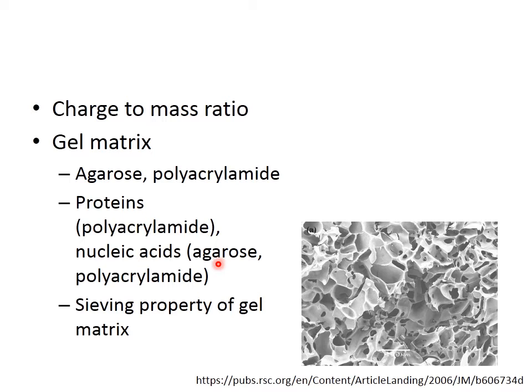However, small nucleic acids like oligonucleotides, of tens to hundreds of nucleotides, cannot be effectively separated on agarose gels. So small nucleic acids can be separated on polyacrylamide gels.